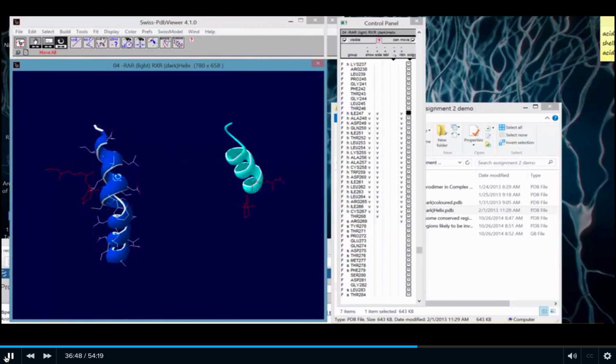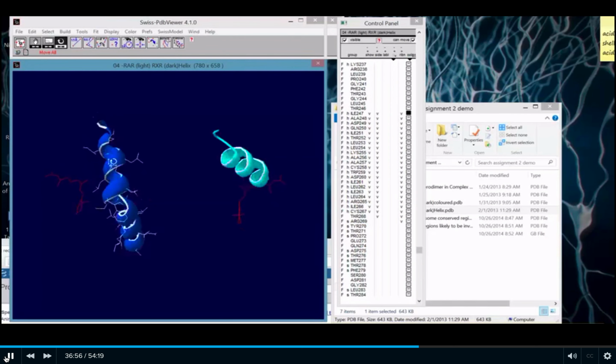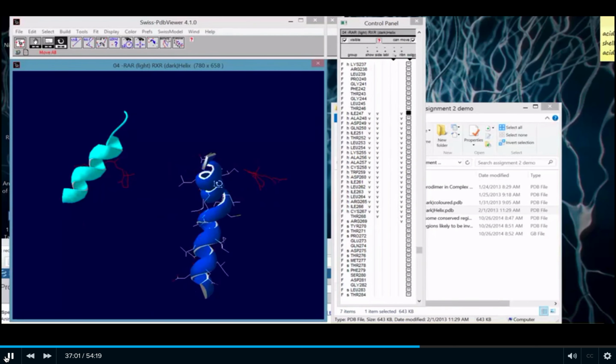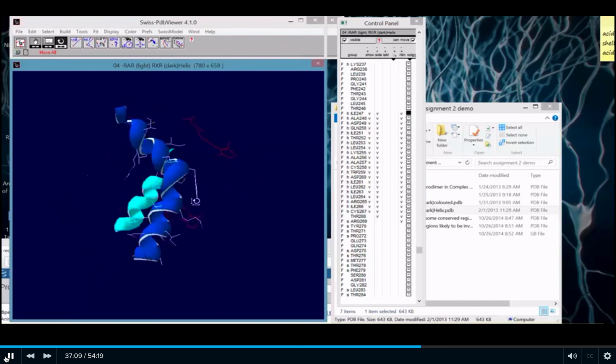It massively moved this, so I've sort of exaggerated greatly. But if you look now, if this was an all-trans molecule, you'd have a tail going straight up and down. And if you look, it's free and clear. There's nothing blocking it now. I've taken this stringent protein and made it more promiscuous. And obviously I've done this here to an extreme, so it's probably not likely to happen. But that's just an example.